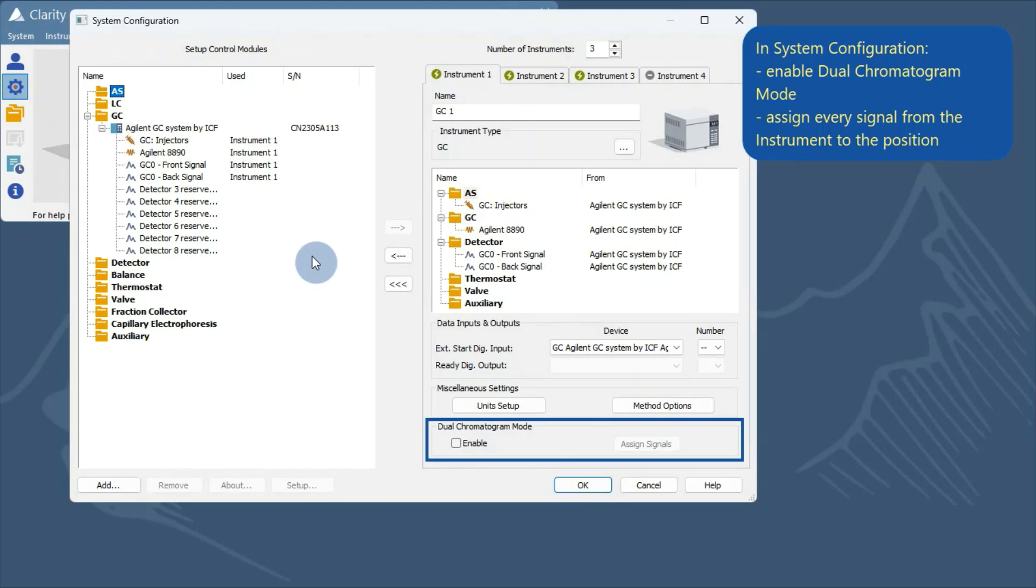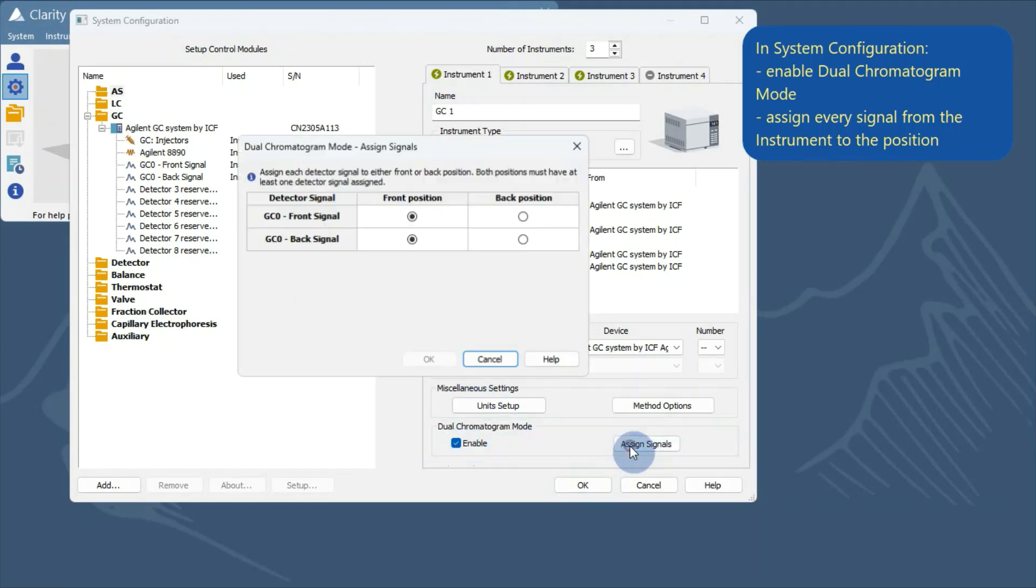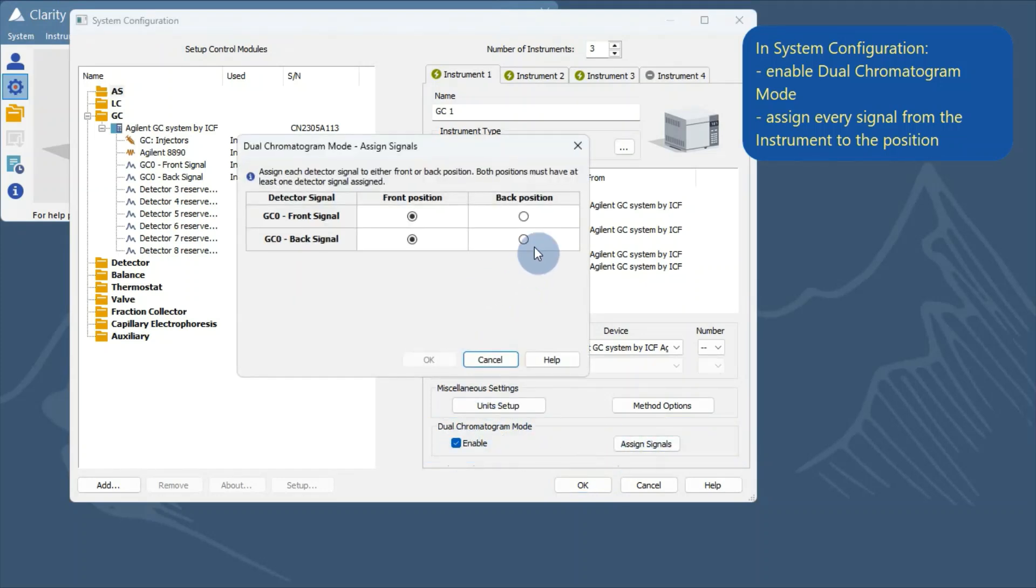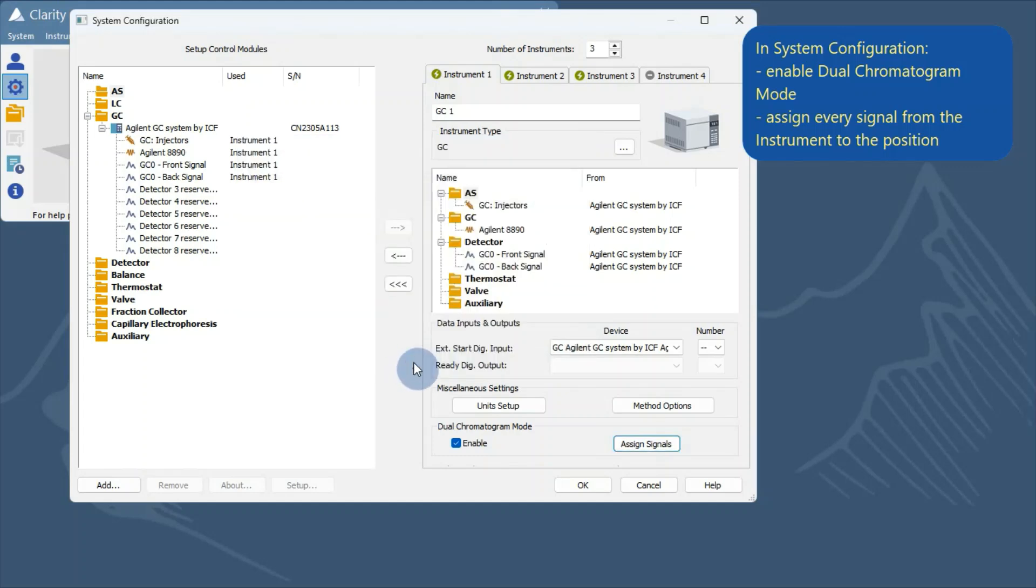You must select which detector signals will be assigned to the front and back chromatograms. This labeling is maintained throughout the entire Clarity process. This ensures that the selected signals are correctly assigned, allowing for independent processing while keeping acquisition synchronized.